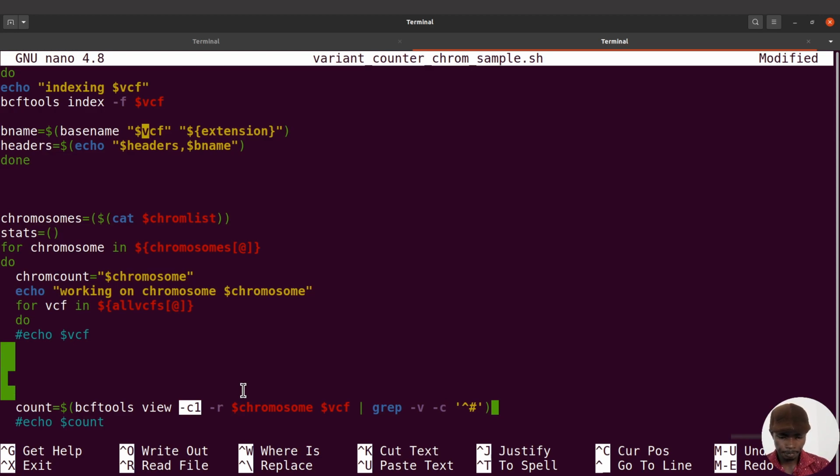If you perform your variant calling, you have the true variants. You also have those that are false. So the -c 1 will help you to identify the correct or true variant. And then I also encourage you, after running the script, to compare the result you have to the result that you get from using other tools, and see if the results are consistent. It's advisable to do that, and just make sure that everything is okay.